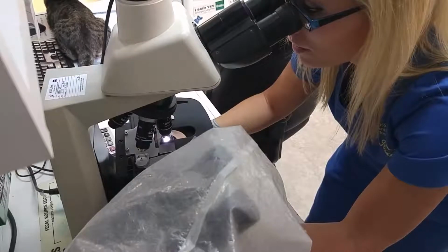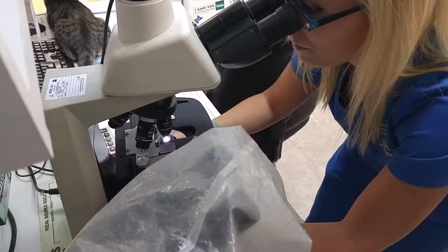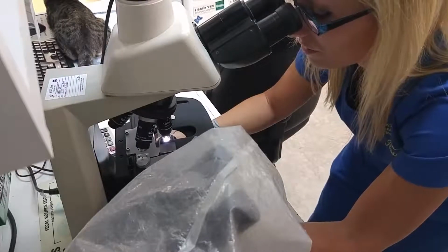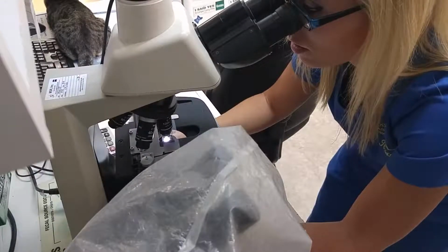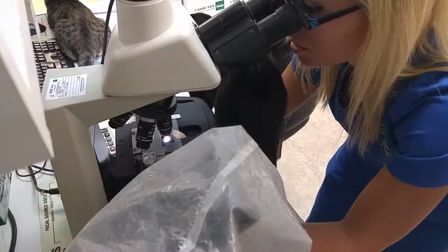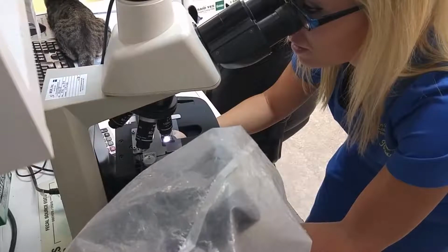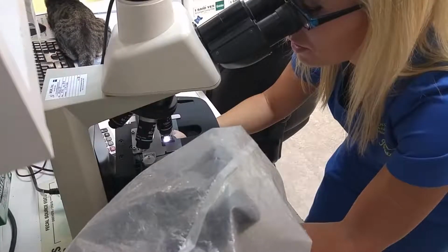So far, not seeing any yeast. Sometimes we'll see budding yeast. So far, I'm not seeing any of that. That's about all you look for on an ear slide.